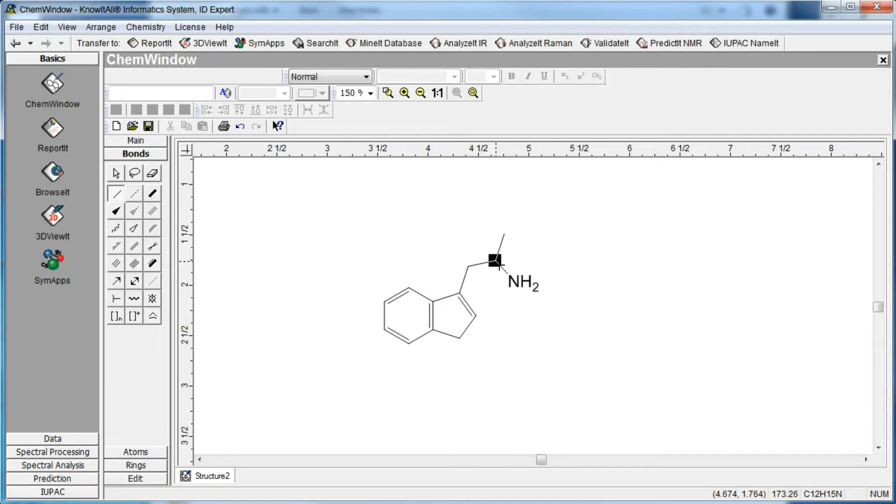When using a hotkey, you can change the number of hydrogens attached to the atom by pressing the hotkey repeatedly. Numbers are automatically displayed as subscripts.